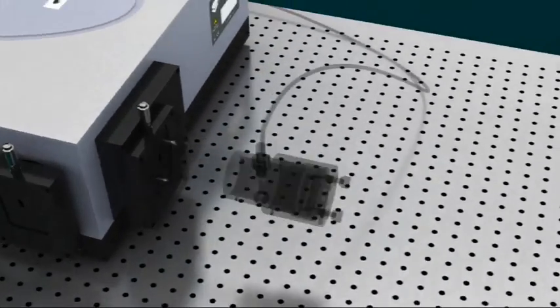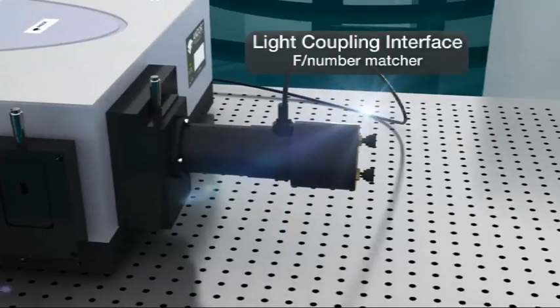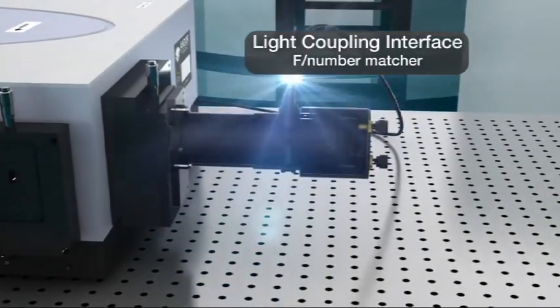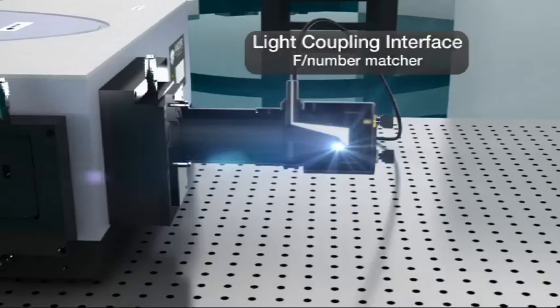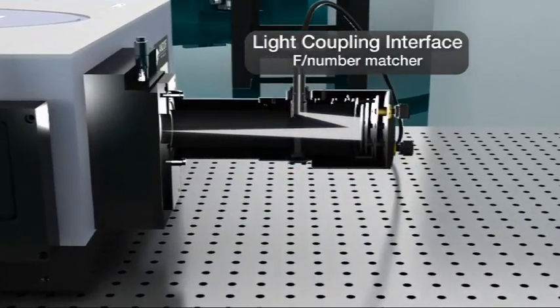Andor Technology also offers a variety of fiber-optic coupling interfaces, including F-number matchers and a range of visible to near-infrared optimized fiber optics for maximum flexibility and higher signal collection efficiency.